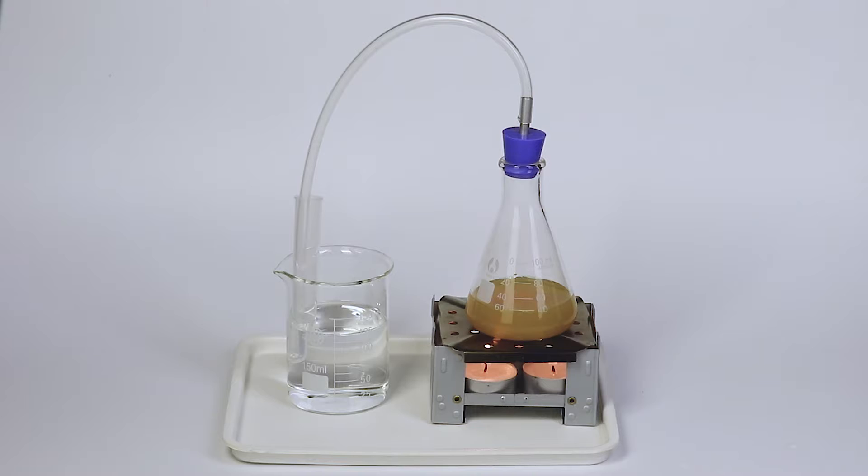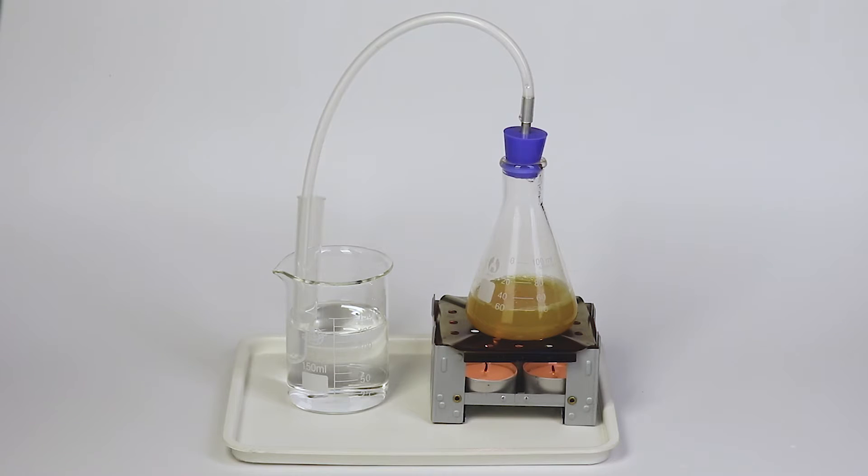Fruit juices contain fragrant substances as well as water. When a fruit juice is heated, these fragrant substances evaporate more quickly than water, with the result that they separate from the fruit juice and flow through the silicon tube into the test tube.